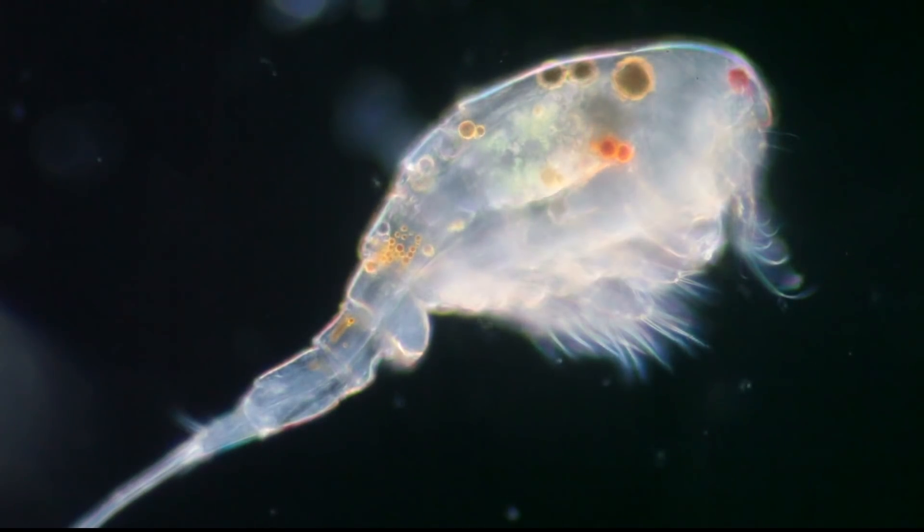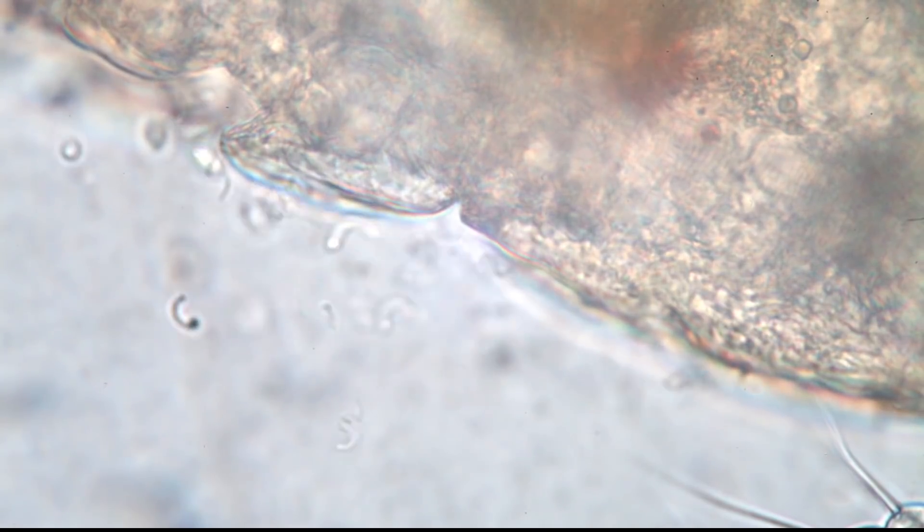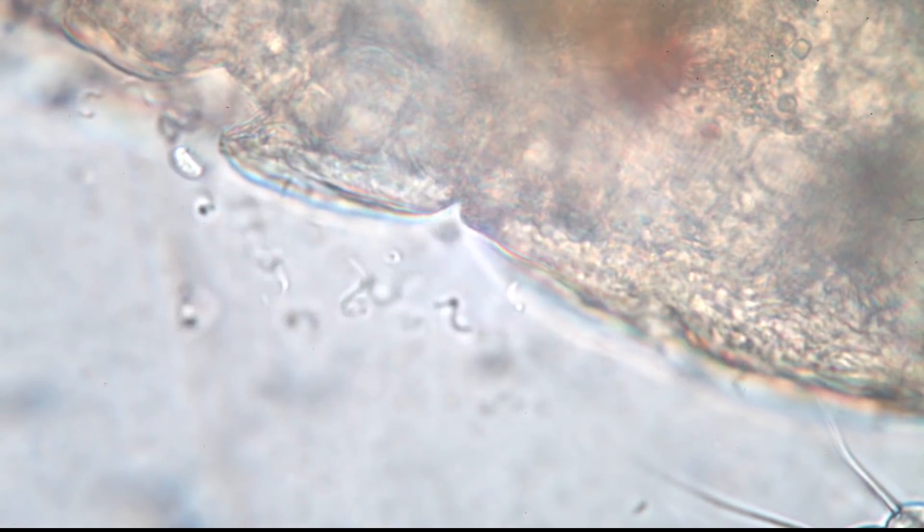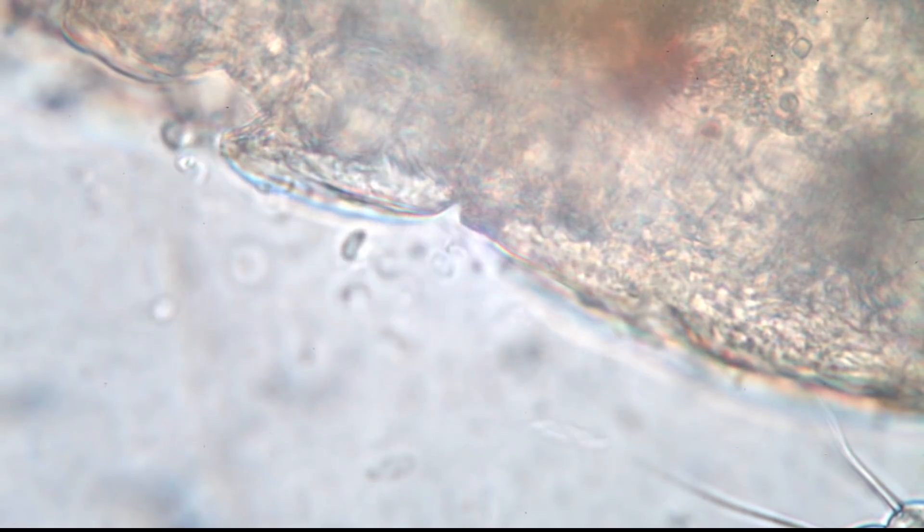This is a microscopic little crab and you can see that it's living happily in the freshwater. Its organs are moving, but it's soon going to be dead because it's being attacked by these spiral-shaped bacteria. These are spirilla and they started to attack and colonize the little crustacean and this actually killed it.